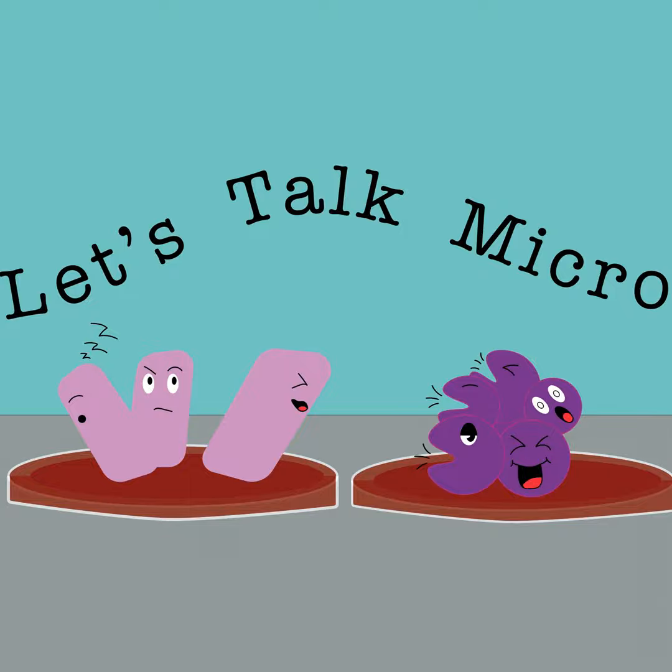Yeah, now that you mentioned the 40X, that's something that definitely happens a lot. Even those of us that work with it regularly, I get used to a microscope, and in my mind, I know that when I rotate from the 10X it goes a certain way, and then I start using another microscope, and next thing you know, I land on that 40 and just get it with oil. So definitely I can see the students doing that.